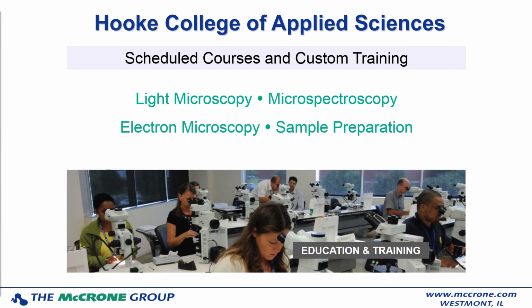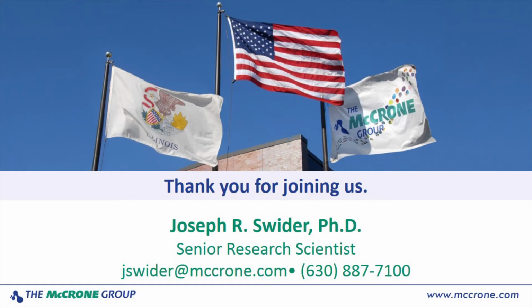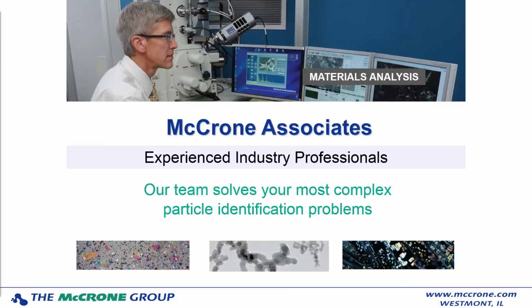Another question is, I use dispersive micro-Raman for polymorphs. Does X-ray have advantages over Raman? We can also do polymorphs. We get this question a lot for pharmaceuticals, but we would need to have the reference of the polymorphs to determine those. We don't determine crystal structures from unknowns, from an unknown crystal structure, I guess I should say. But to determine different polymorphs, for instance, of an API, we would need to have those references.